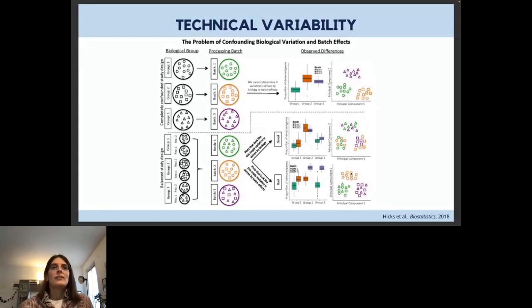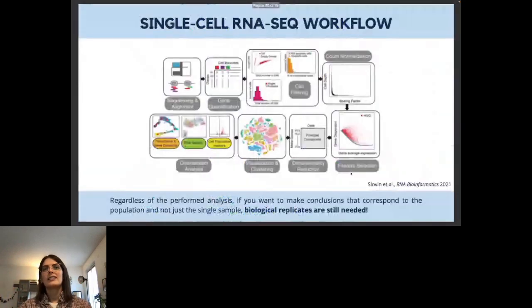Then I will give you a little bit of an overview of the workflow, just so we know what we are focusing on. I will start briefly to explain this initial part that we will not see computationally because it would take too much time, but it is always important to know the logical steps in the workflow. So first of all, we have the sequencing and alignment. We have the gene quantification, and we will see just now what this is.